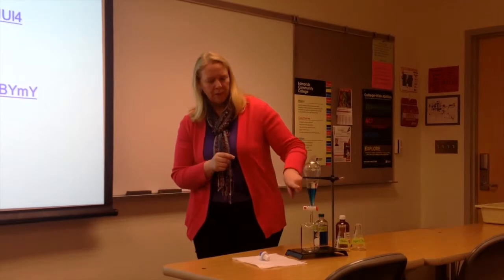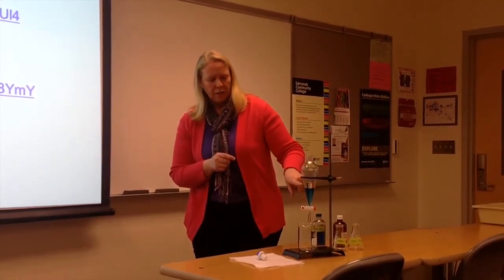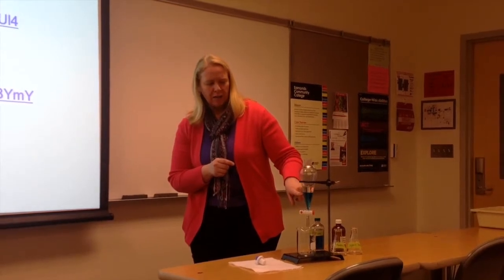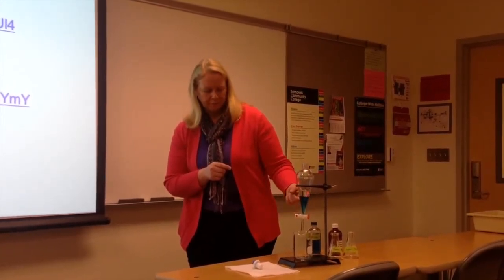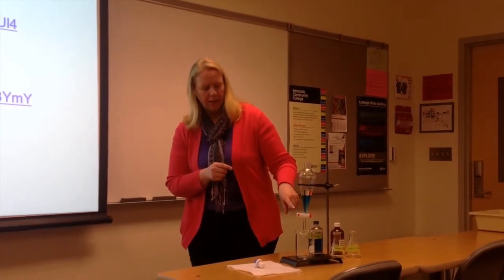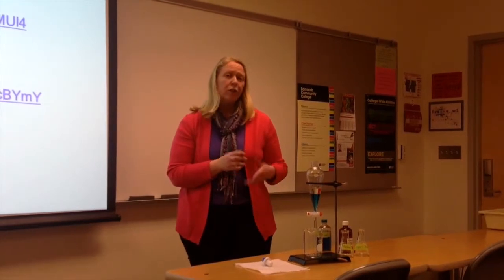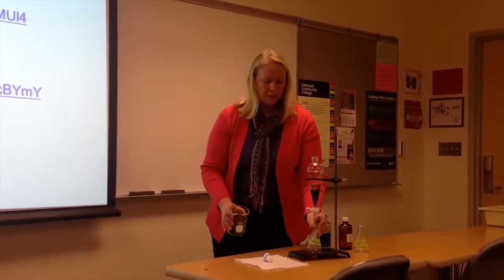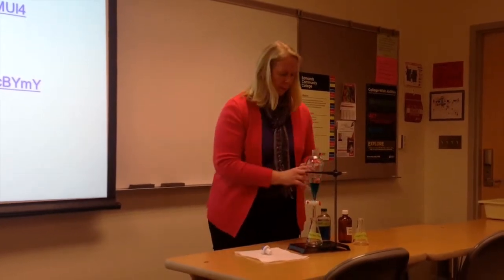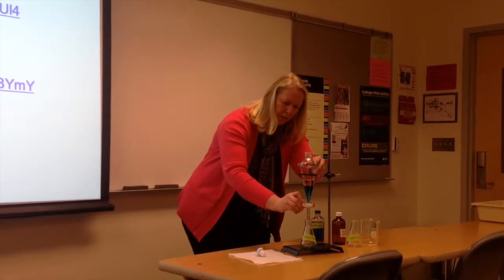What should have happened is that you have your organic compounds in here. The base should have now interacted with the carboxylic acid and made the carboxylate out of that and be transferred into this bottom layer here, the aqueous layer. So you want to separate those 2 layers. So you're going to drain the bottom layer into a flask that hopefully you labeled aqueous layer, and you're just going to open the stopcock and let this drain.